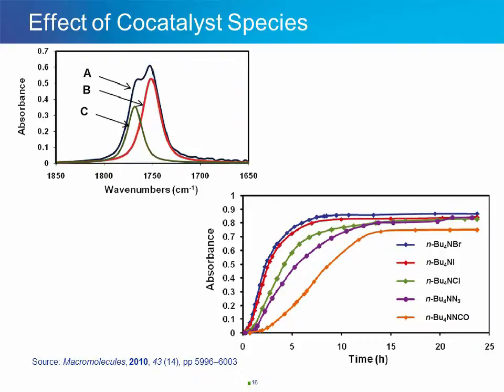The first is to point out how difficult this data would be to obtain, if not completely impossible by offline analysis, making in situ mid-infrared spectroscopy a perfect tool and very enabling technology. The second is that for those of you that read the paper in detail, the spectra were deconvolved to give the chemometrically derived pure component spectra that were needed to generate the concentration profiles without having interference from the other component.